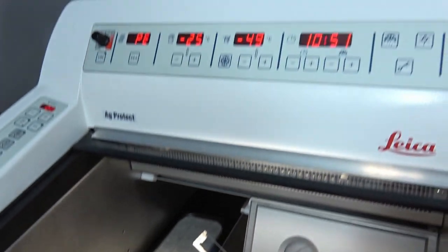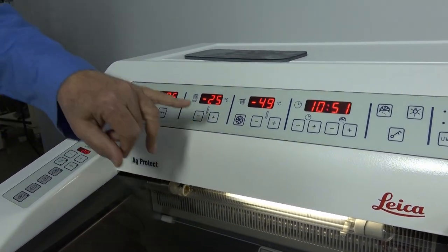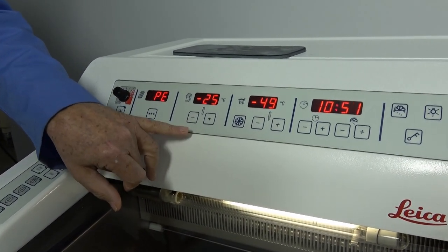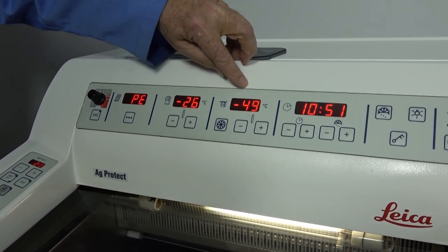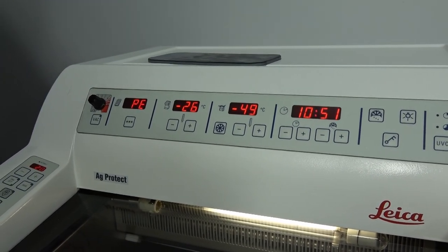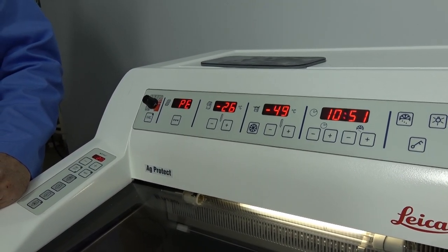This unit, being that it does have a cold head, means you don't generally need the chamber to get as cold. This one does not get to factory specs on the chamber temperature, but because of that the sample head will get to minus 50°C. It will keep your samples in the zone that you want, getting them good and solid for you.